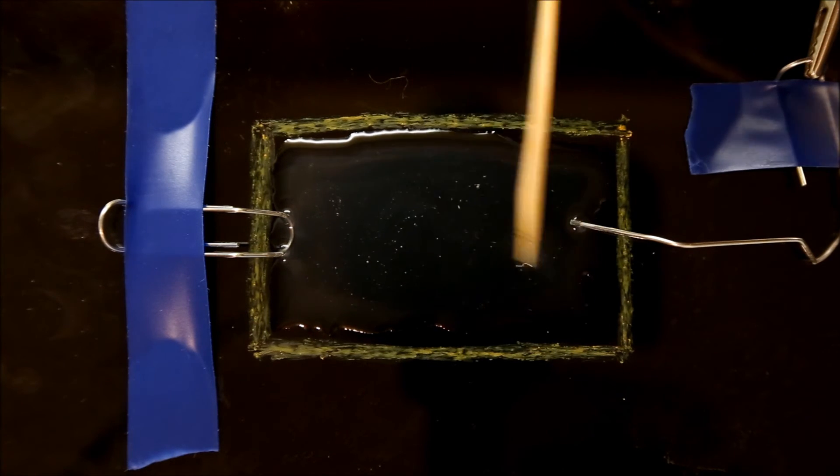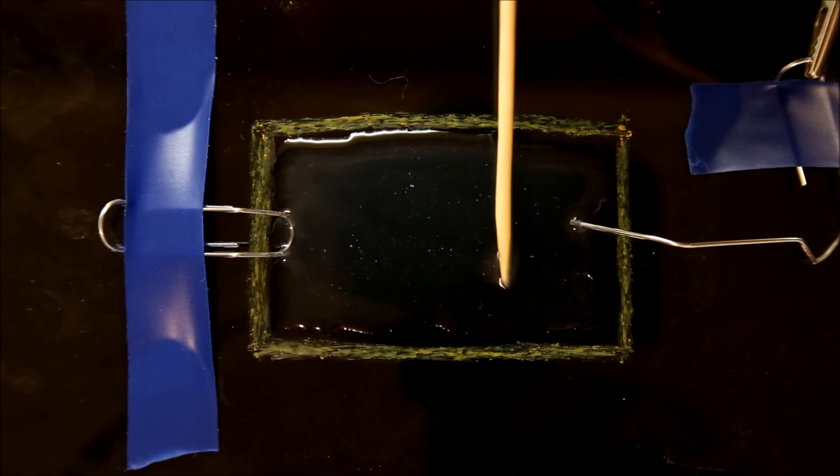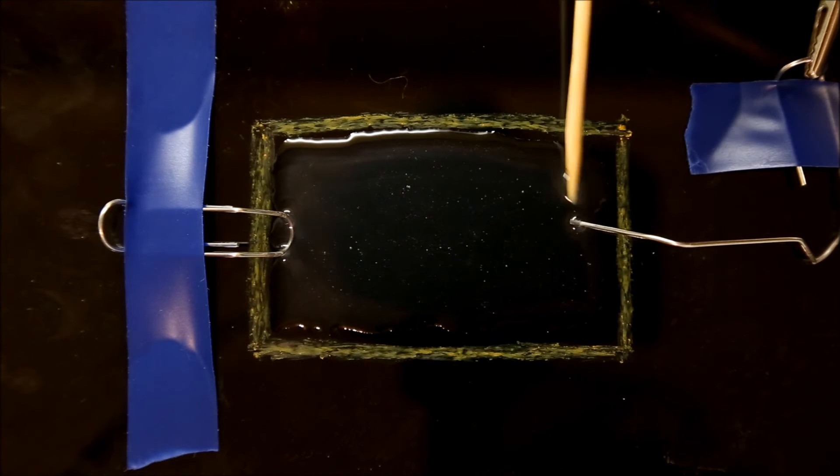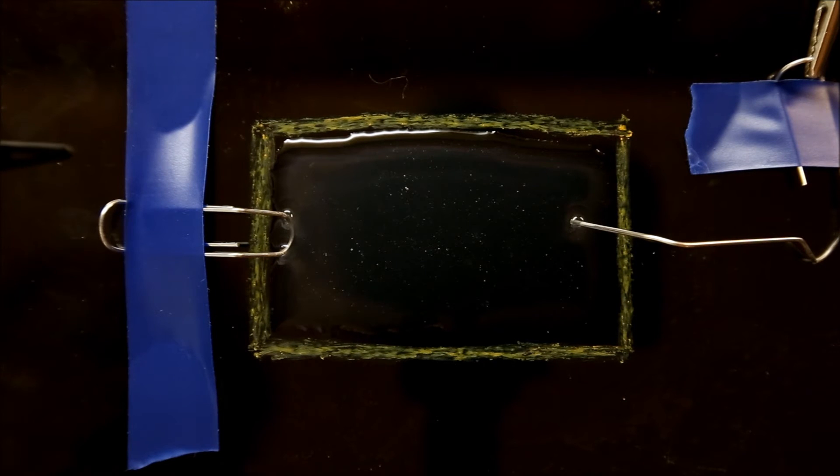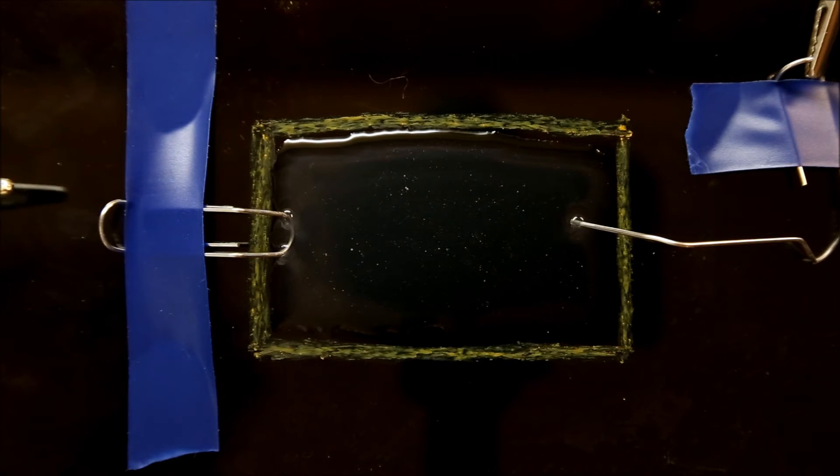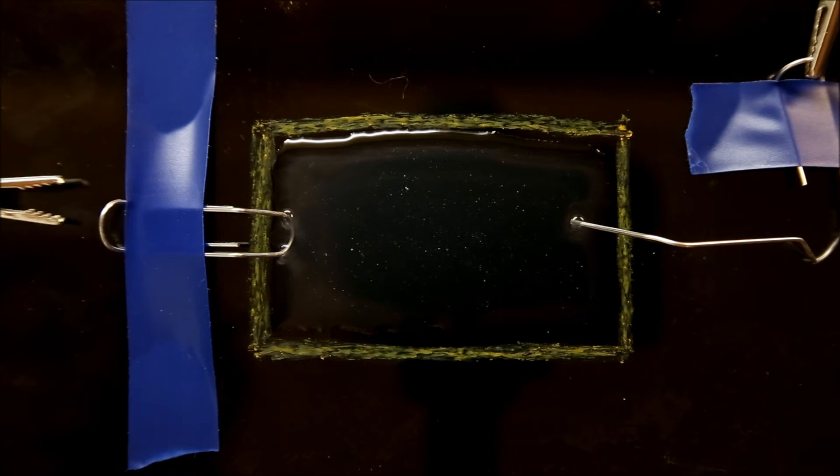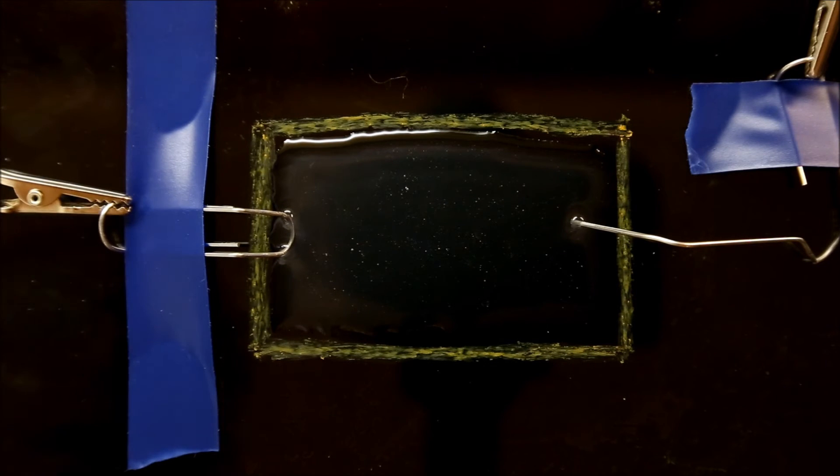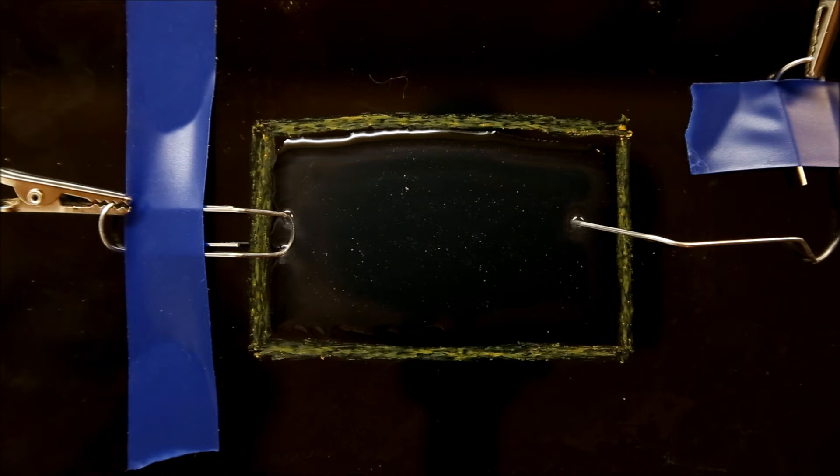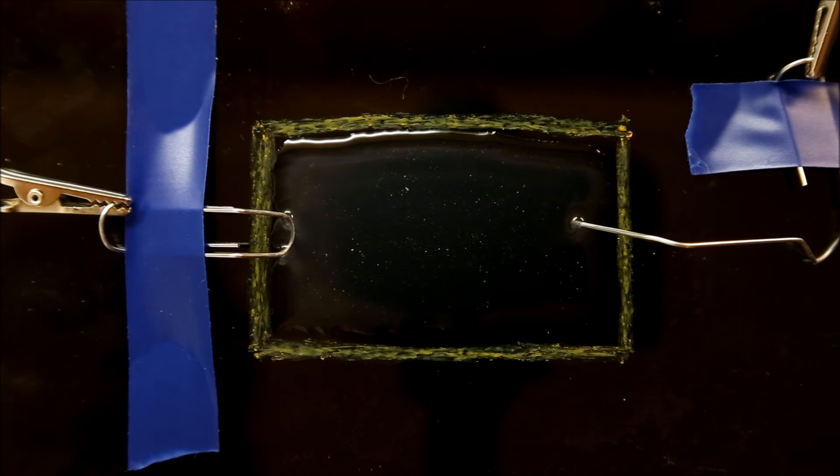When you're spreading it, make sure that both electrodes are in good contact with it. Once the solution is spread out, plug your power supply in and connect the clip lead, and you should start to see crystals growing fairly quickly.